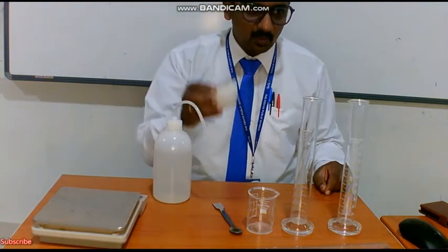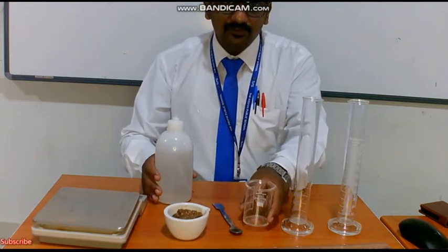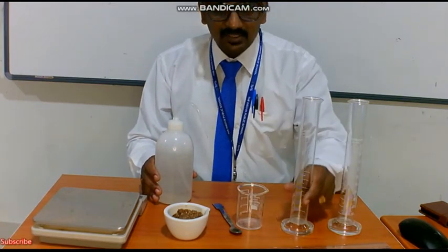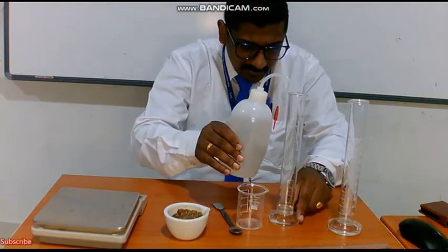First, what we have to do is we have to weigh 50 grams of soil and we have to take 50 ml of water. Don't take it straight away from the beaker. Take the measuring cylinder where we are going to do our experiment. Since it is a colorless solution, you have to take it at the lower meniscus.